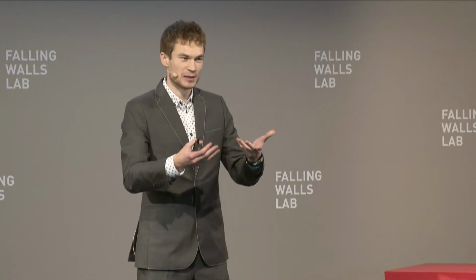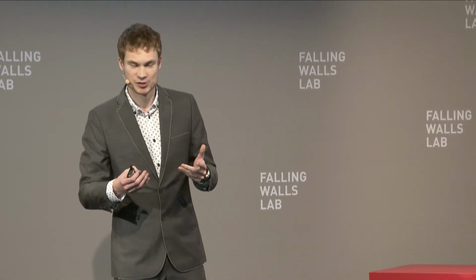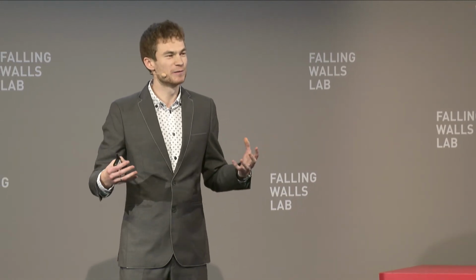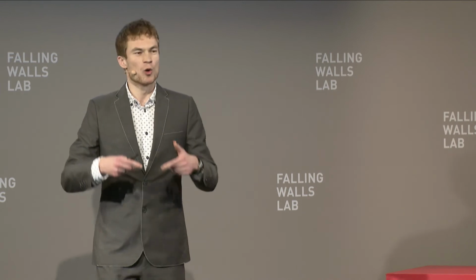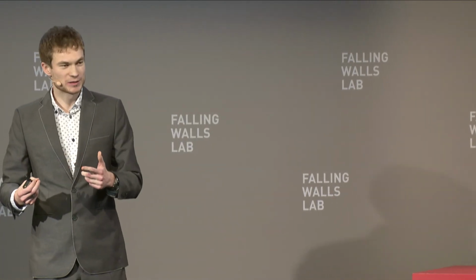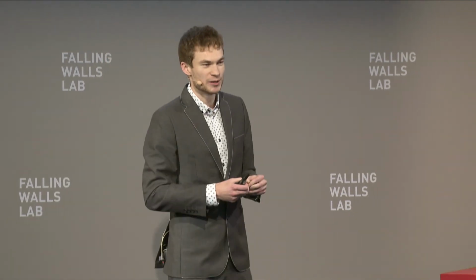And because they are magnifying it, you can use detectors which are bigger. And bigger detectors are much more efficient than smaller detectors. So the whole key point of this is that you can image super small things without the need of super small detectors. And you can be much more dose efficient, so you don't want to kill your sample with X-rays, for example.